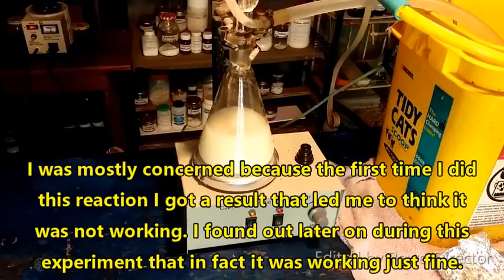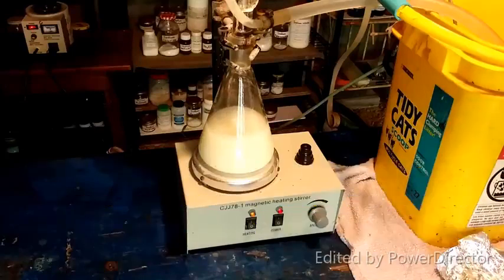So anyway, that's where we're at now. Again, the fact that we've got so much white solid that's dropped out is extremely encouraging. That is exactly what we want to see. That is our insoluble sodium chloride.